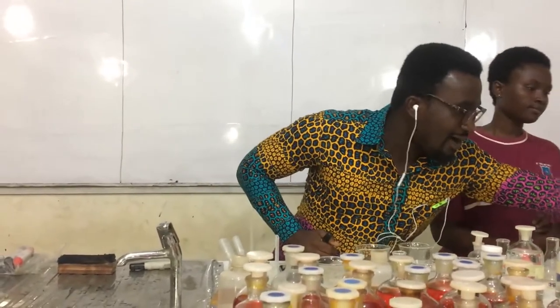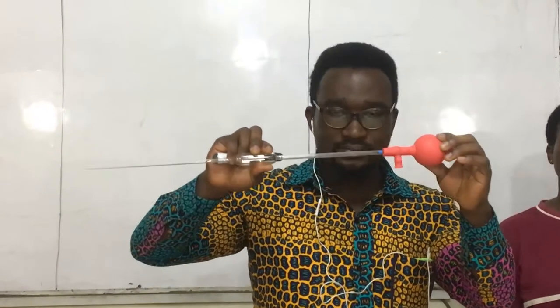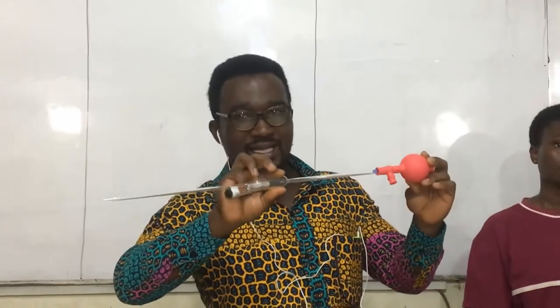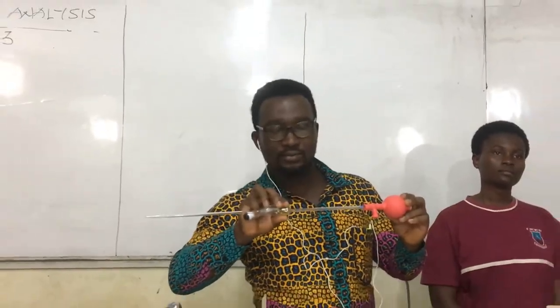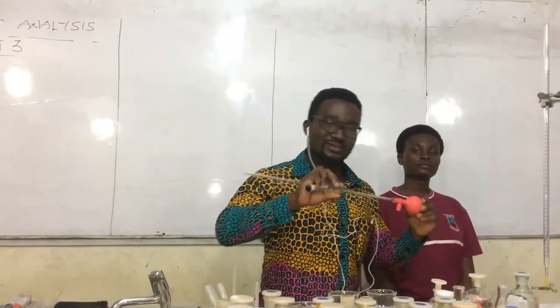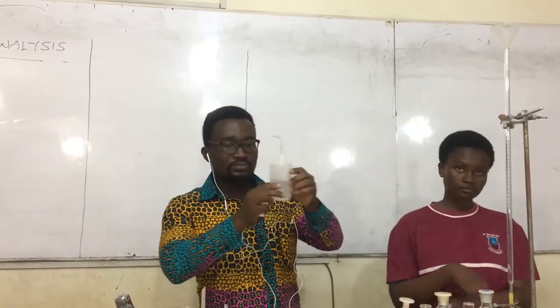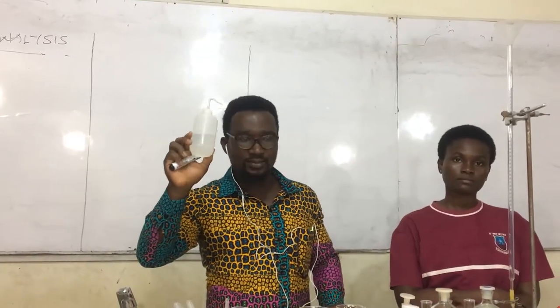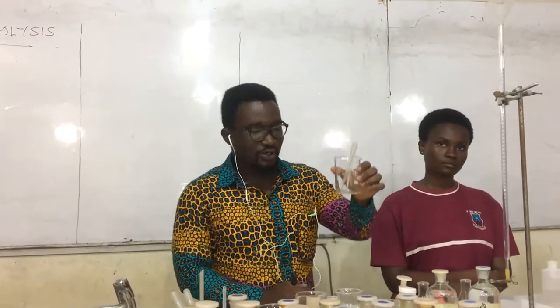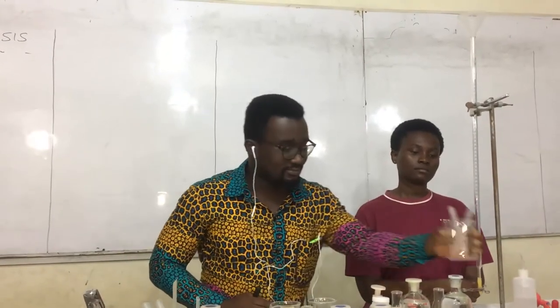Now we also have our pipette with a pipette filler, which will help us to suck up and eject. This pipette has also been rinsed 3 times with tap water and then 3 times with deionized water. Deionized water is the same as distilled water. We have our wash bottle, which is also filled with deionized water. We have our dropping pipette, which will help us pick a few drops of the phenolphthalein as our indicator.